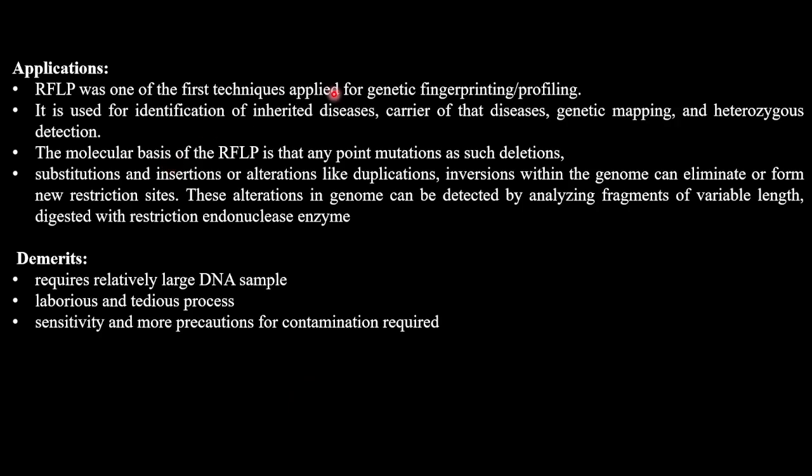RFLP was one of the first techniques applied for genetic fingerprinting and profiling. You can identify inherited diseases. Suppose the disease is recessive in nature and is caused by the small a, then you can identify if the individual is small a by RFLP. If the individual is capital A small a, a carrier of the disease, you can also identify. Means the heterozygous condition you can also identify.